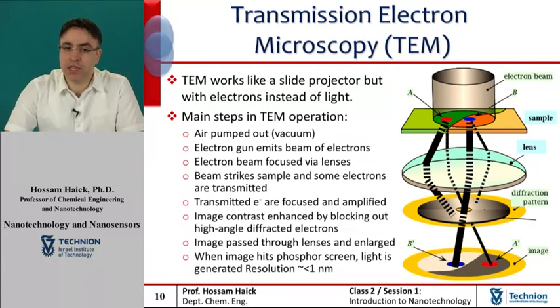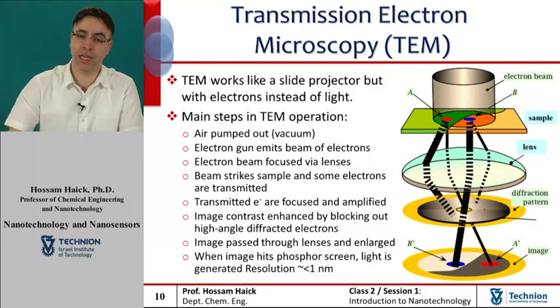TEM forms a major analysis method in a range of scientific fields in both the physical and biological sciences. TEMs find applications in cancer research, virology, material science, as well as pollution, nanotechnology, and semiconductor research, and of course, in the current lecture, we will focus on nanotechnology.